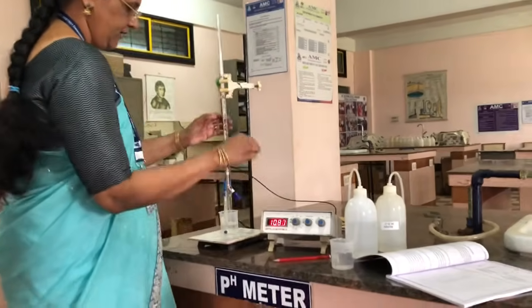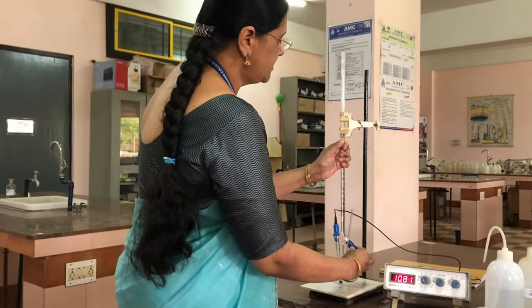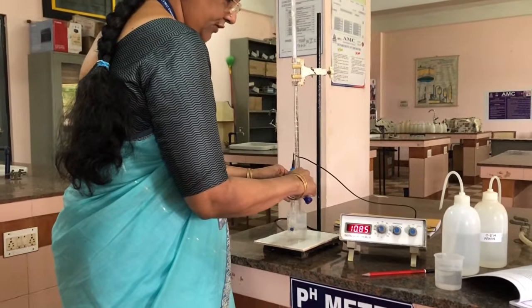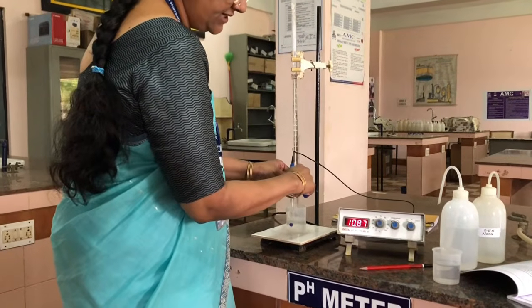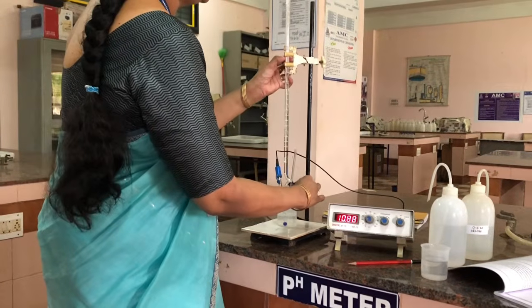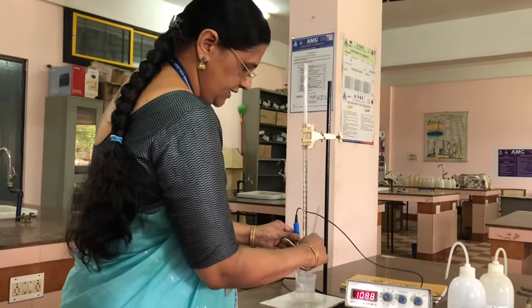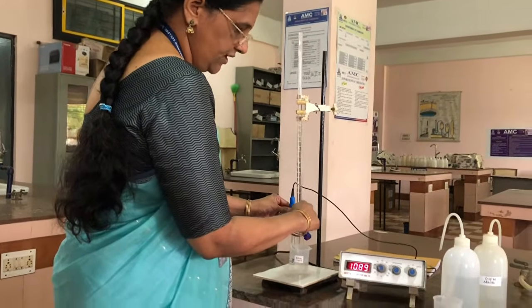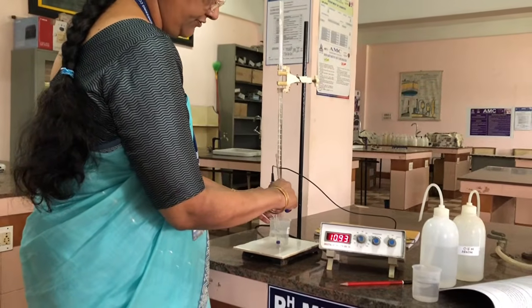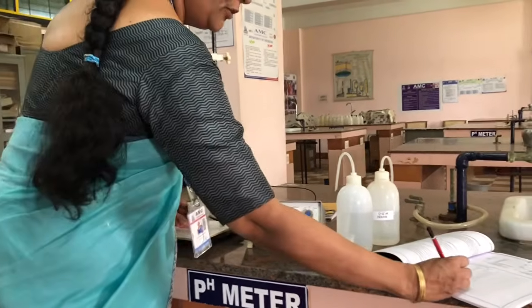There is no change. So when there is no much change, you have to add 2-3 times 0.5 ml increments and shake the solution and note down the readings. There is no much change, 10.8 only it is showing. So again we are adding 0.5 ml and again shaking the solution. So even after addition of 0.5, 0.5, 0.5, there is no much change. So 10.8 to 10.9 only.